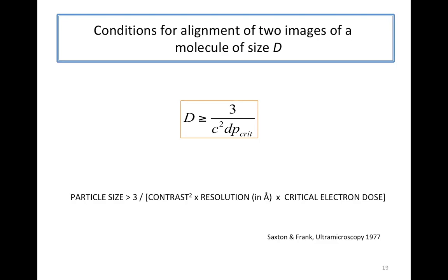The solution was an inequality between the particle size and the contrast, the resolution that we aimed for, and the critical dose.